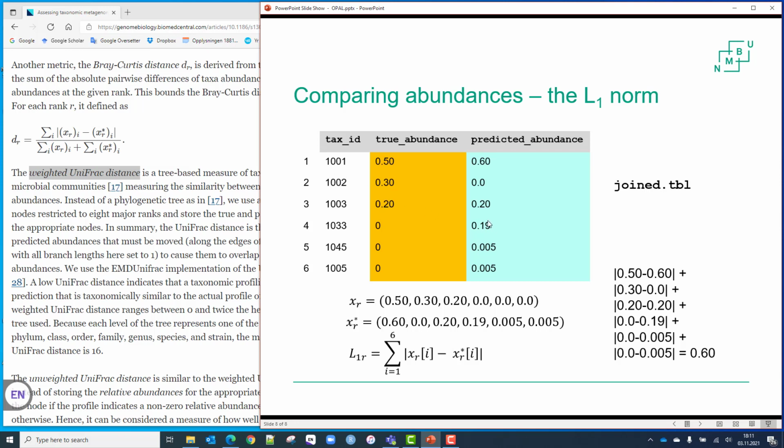So that actually we claim that these reads are from this species, but we are now confusing it with this species here, and we should actually have assigned these up here. So if that is the case, then the picture is not as poor as it looks like now. Do you agree? You missed, but you missed only with the neighboring species, you could say.